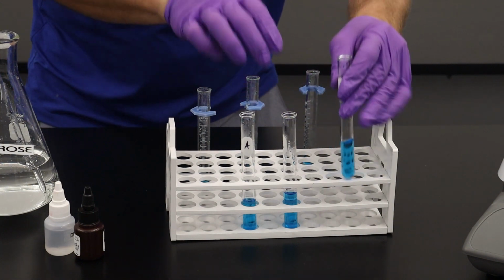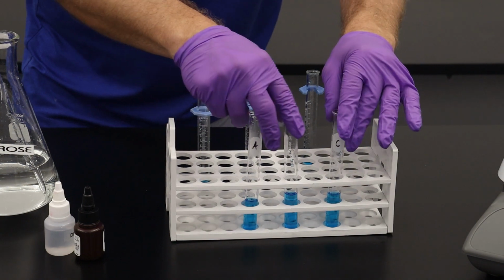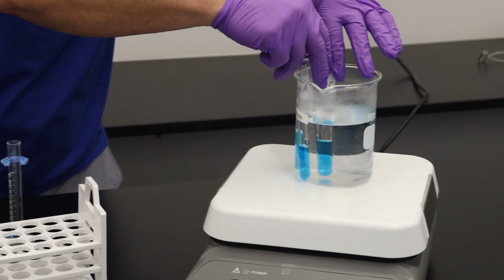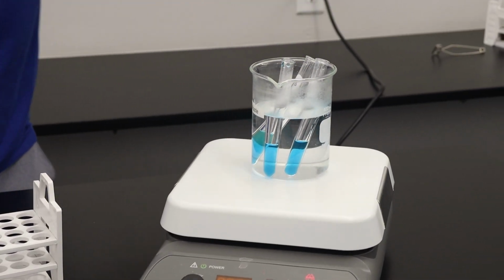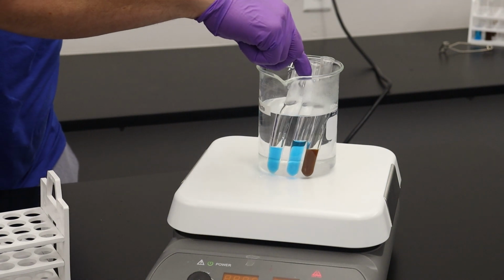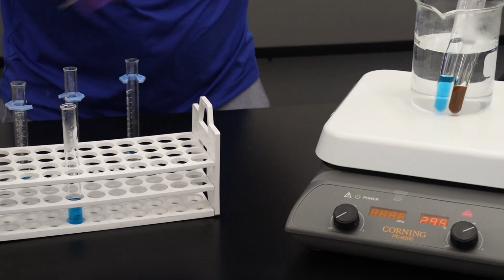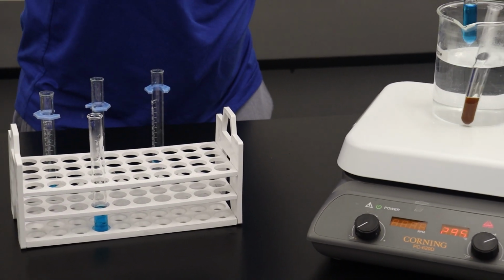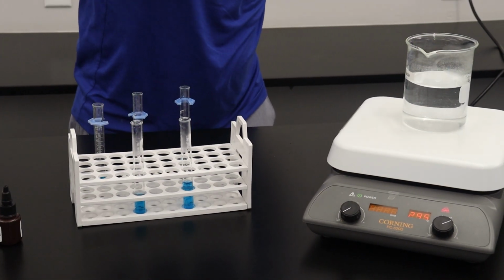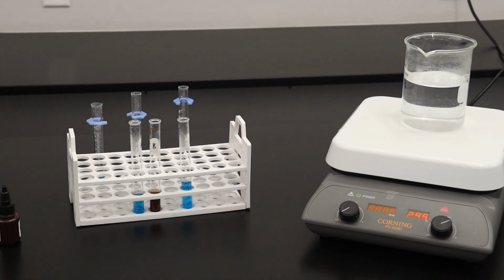Again, we're going to give them a gentle mix, and we will place them back into the water bath for 2 more minutes. At the end of 2 minutes, we will remove our test tubes from the water bath. We can observe and record our results.